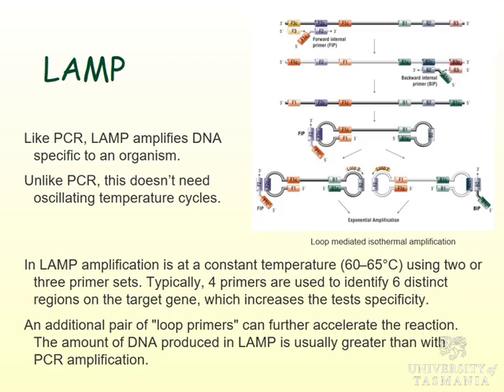And then eventually the enzymatic reaction is, rather than blowing apart double-stranded DNA to single-stranded DNA, linear and anneal again, it's actually using what we call a rolling circle amplification. So once you've got a loop, the enzyme can start ticking around here and copying it, and then that can fly off, and you do another copy and another copy and another copy. So just go round and round and round in circles, continually copying and making lots of copies of your target and huge amounts of DNA in the process. So this looping process can occur at a standard temperature.